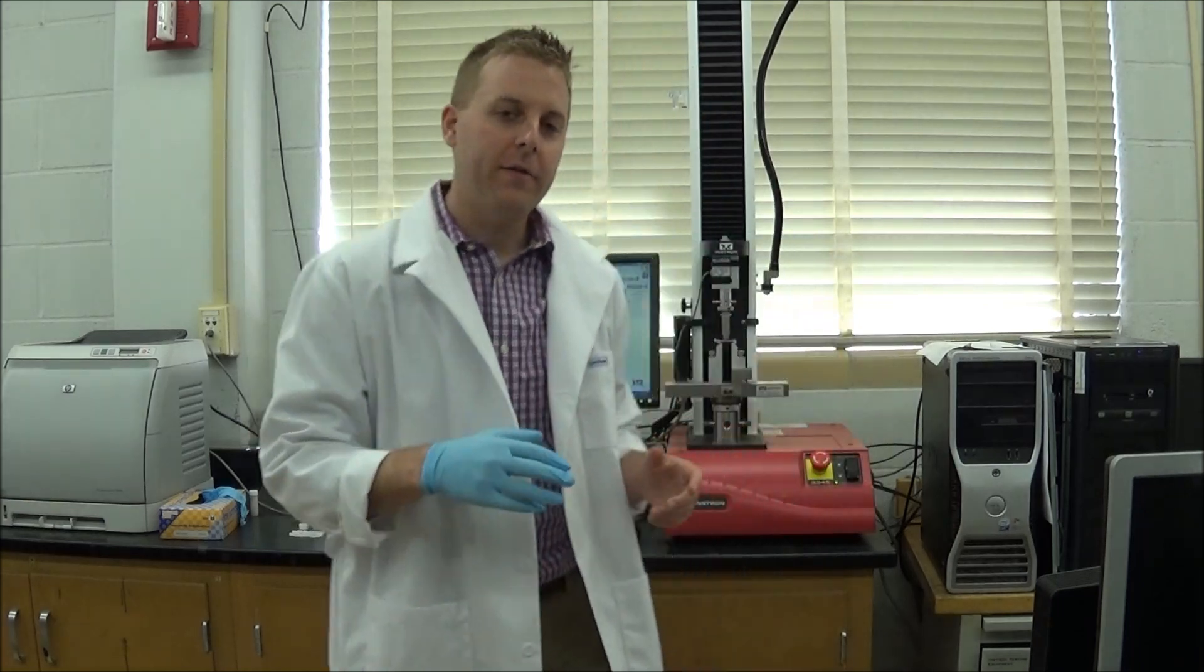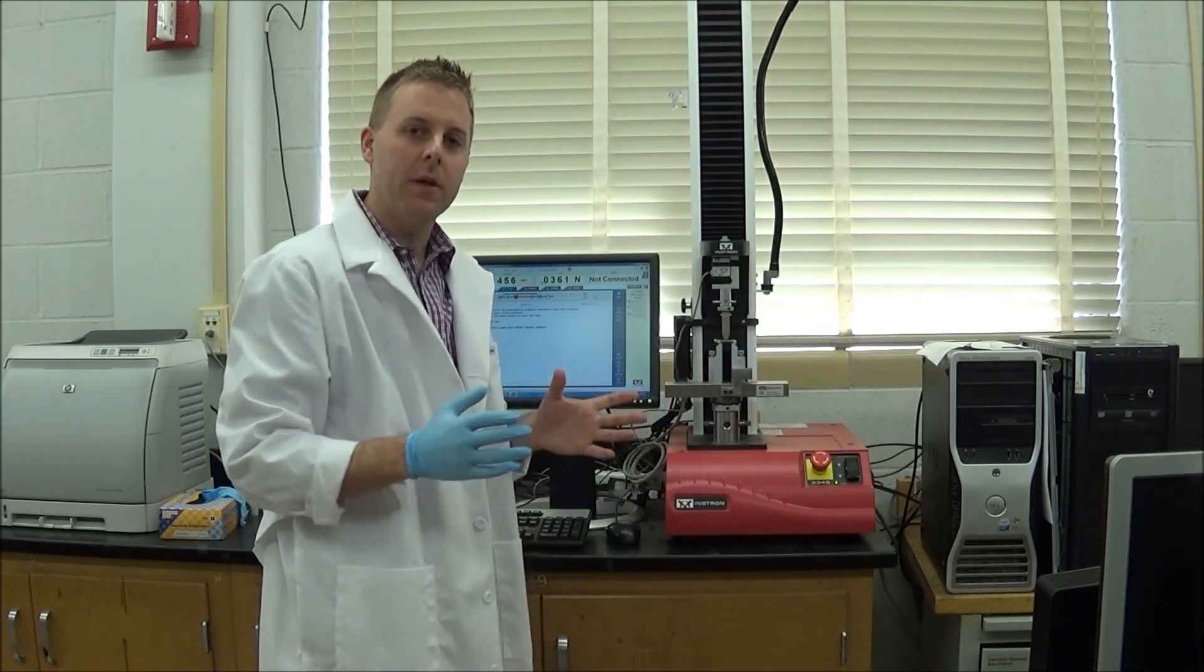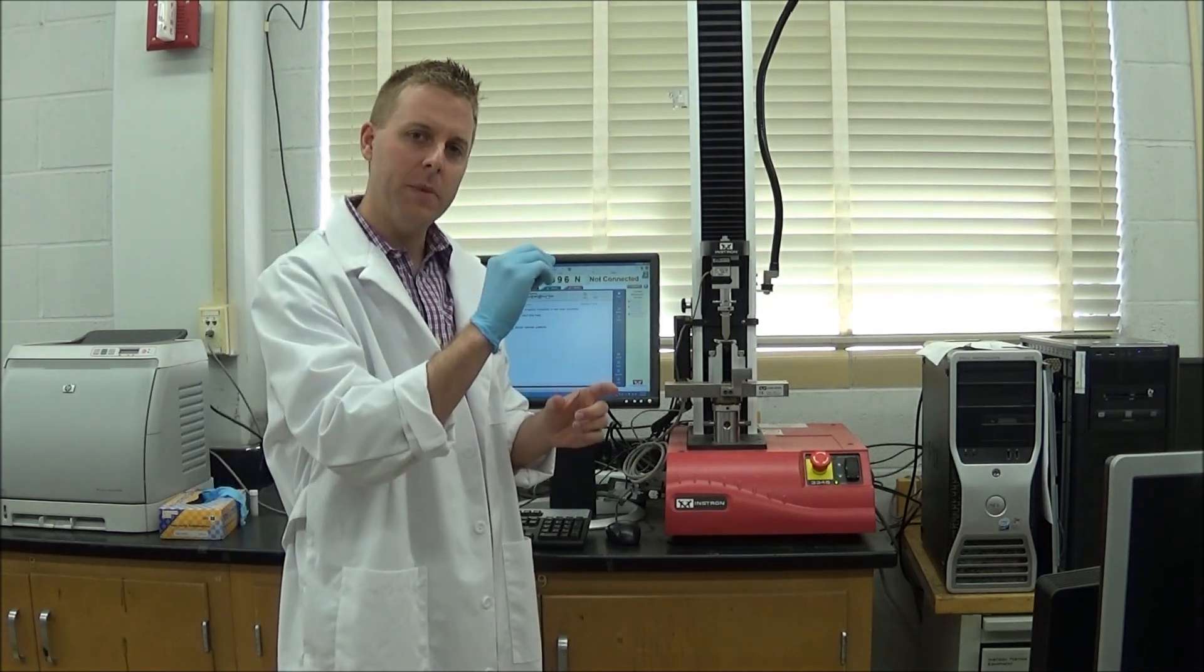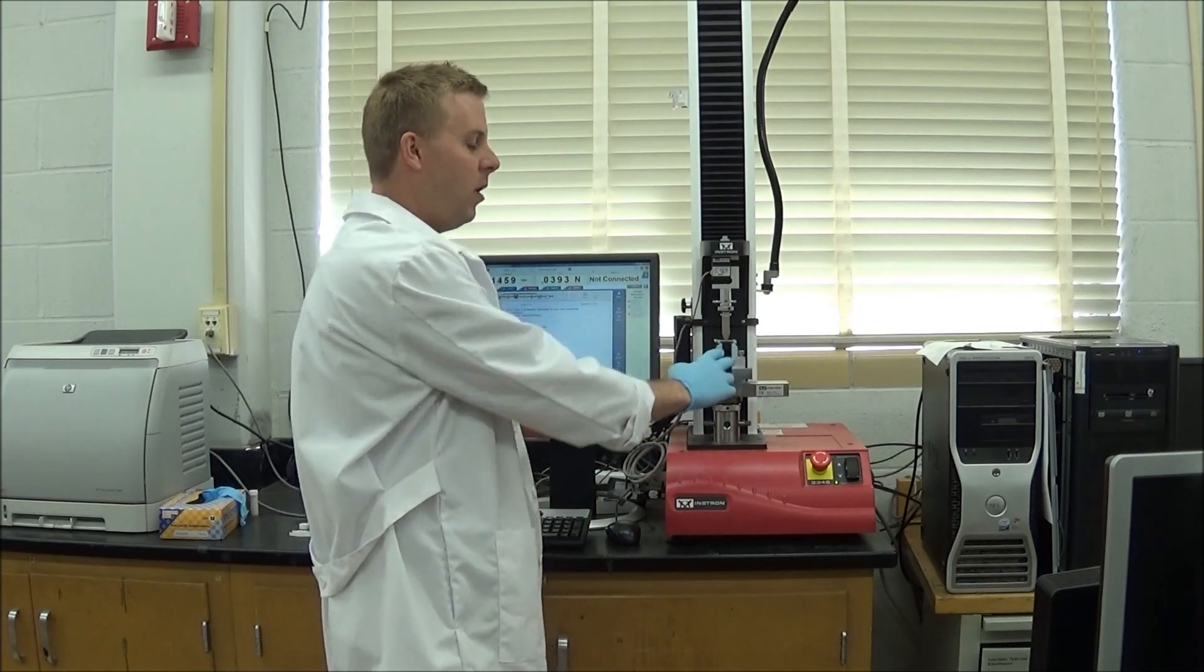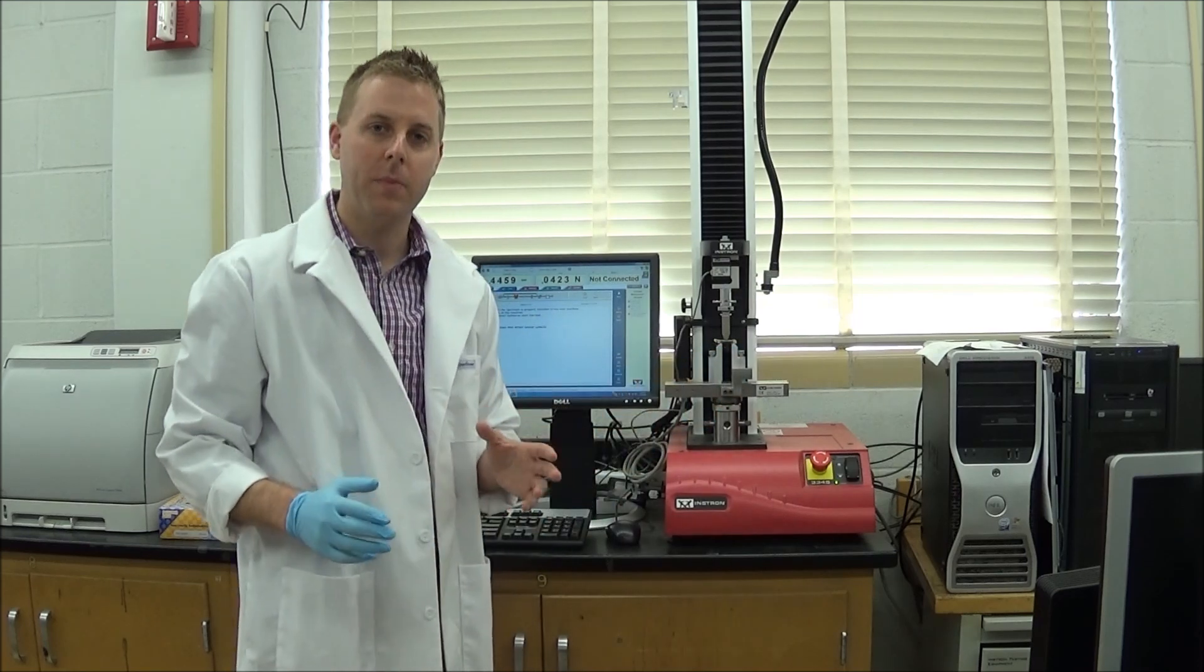Just for a little background information, we use a span length here of eighteen millimeters. That's pretty standard in the bone mechanical testing world. But ASTM standards recommend using a sixteen to one length to thickness ratio. What that means is if the thickness is two millimeters like the thickness of this bone, you should use a span length of thirty-two millimeters. But we don't have thirty-two millimeters to work with on this bone. We only have twenty or so. So we have to compromise, and the compromise that we've accepted in the field is to use an eighteen millimeter span length.